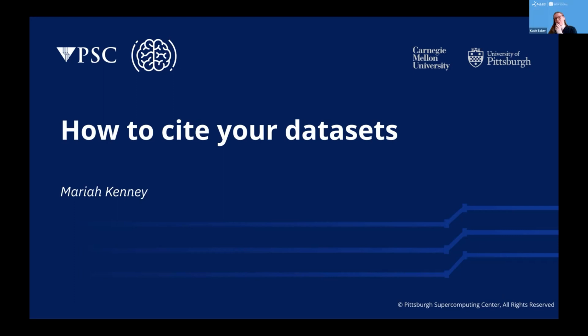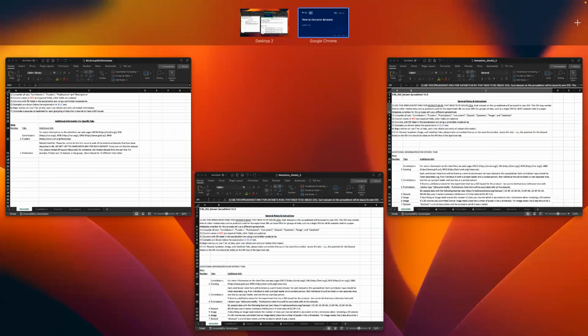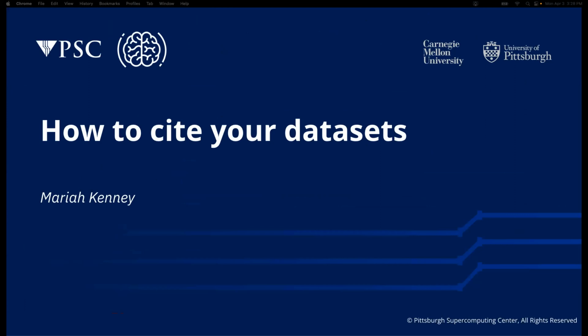Yeah, and it also depends on a lot of other factors. In the validation, it also depends a little bit on the file type that's being validated. Bioformats is a really good tool in that it can open up almost any image file type, but some files it can open up quicker and give you that information than others. It's a more extensive process, so it also depends on how that file was structured.